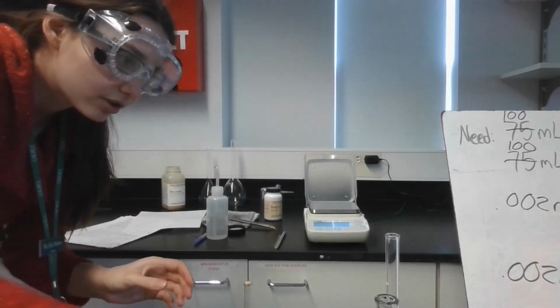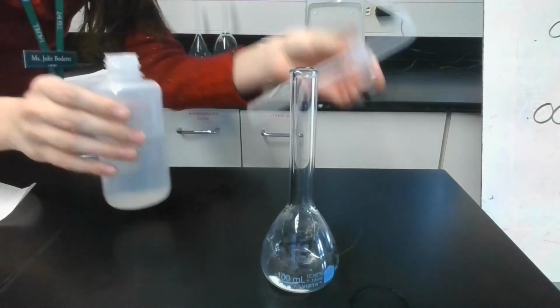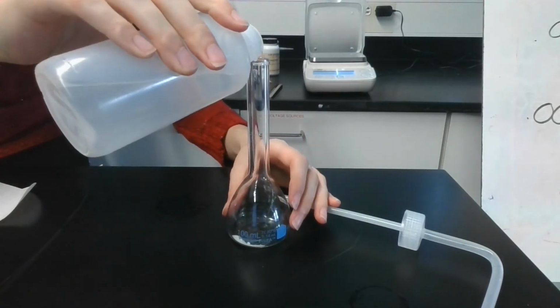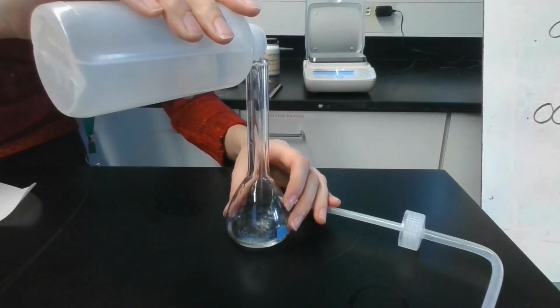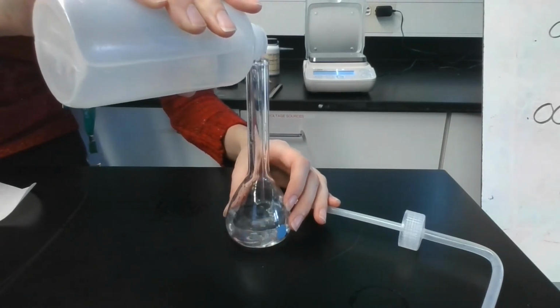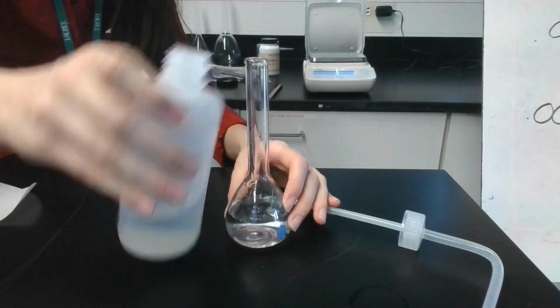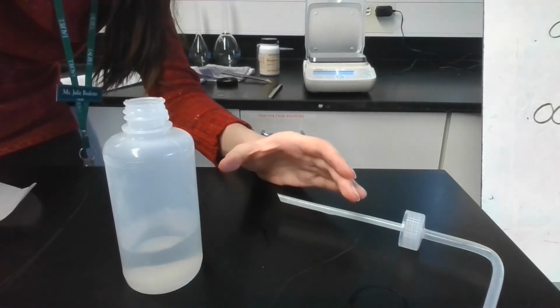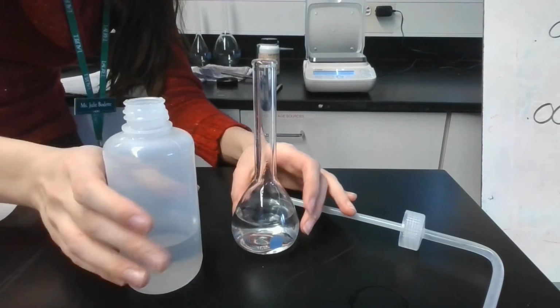And then I'm just going to do the same thing for my other solution. Go ahead and swirl that. Okay, that's pretty dissolved.